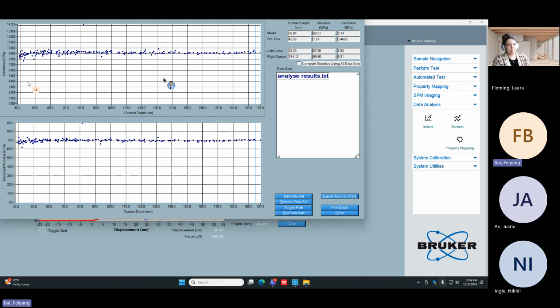However, when I do my measurement, let's say I see the data is a little funny, like jumpy or fluctuating. I guess that's one of my cues that either the tip needs to get cleaned or I need to do another one. Okay. Correct. Yep, you are absolutely correct. If it's jumpy, yeah, I would expect a dirty probe.